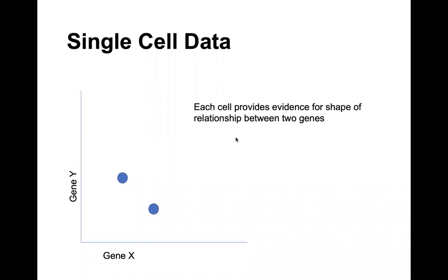So the idea here is that you have these single cell measurements where you have simultaneous measurements of different genes. Because we're measuring something like 20,000 different genes, especially after you denoise your data, for example, with MAGIC, you'll see how 2 genes vary together because you have simultaneous measurements in many single cells.